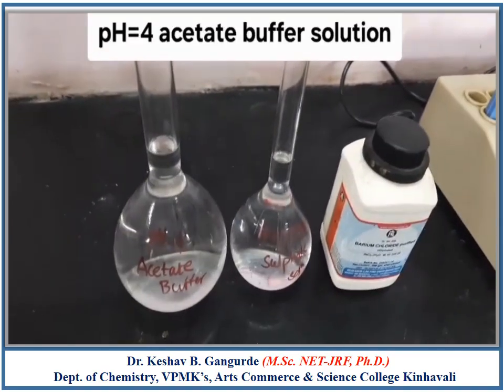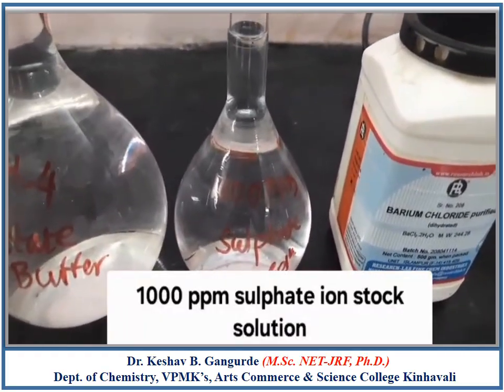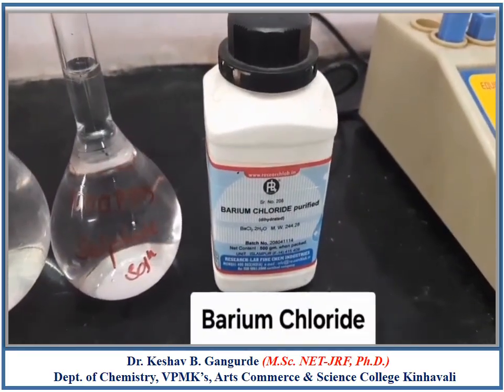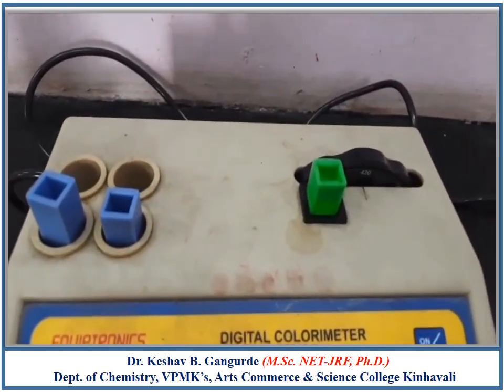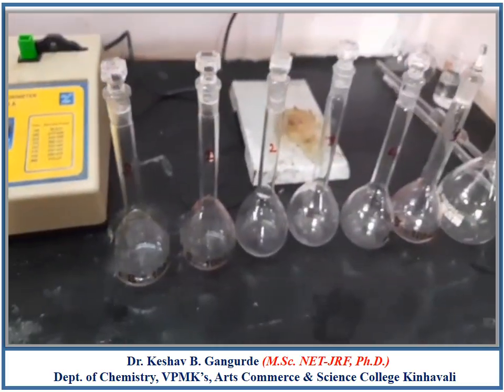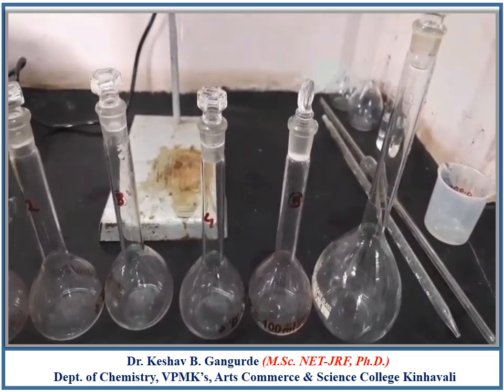For this experiment we require pH 4 Acetate Buffer Solution, 1000 ppm of Sulphate Ion Stock Solution, Barium Chloride Solids, Colorimeter with Cuvette with a filter of 420 nm, six 100 ml standard measuring flask, and one 250 ml standard measuring flask.